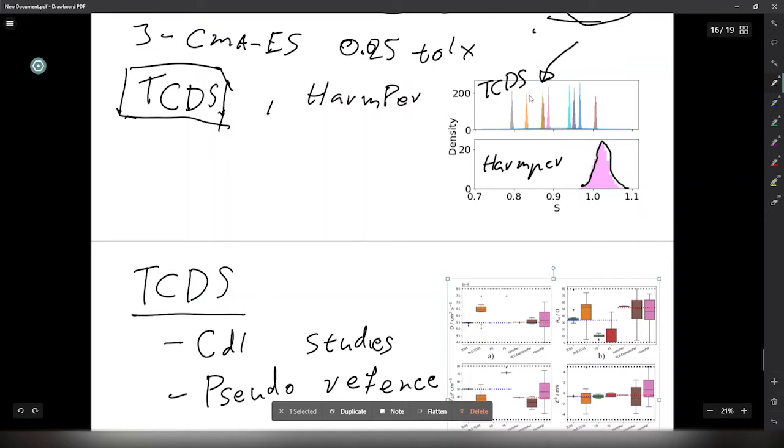TCDS will struggle a lot at this step because you're going to have to calculate the noise as well, and the noise is quite arbitrary. It's generally pretty small. It'd be about 0.1% of the max current, so you can try and figure out what that is from there. But the harmonic percentage will do that very quickly. It does it extremely fast, moving from a non-Bayesian loss function to a Bayesian loss function, so try that as well in CMA-ES, and it should work reasonably well.